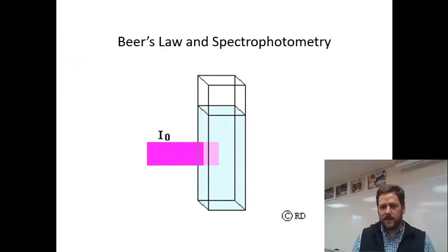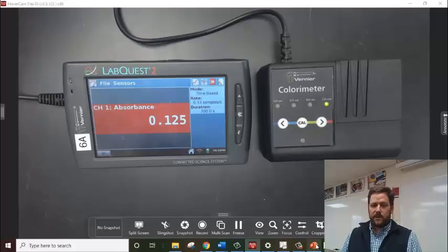Hi everyone, the purpose of this video is to introduce spectrophotometry, which is an important lab technique we use a lot in this class. Here's the spectrophotometer apparatus we'll use.